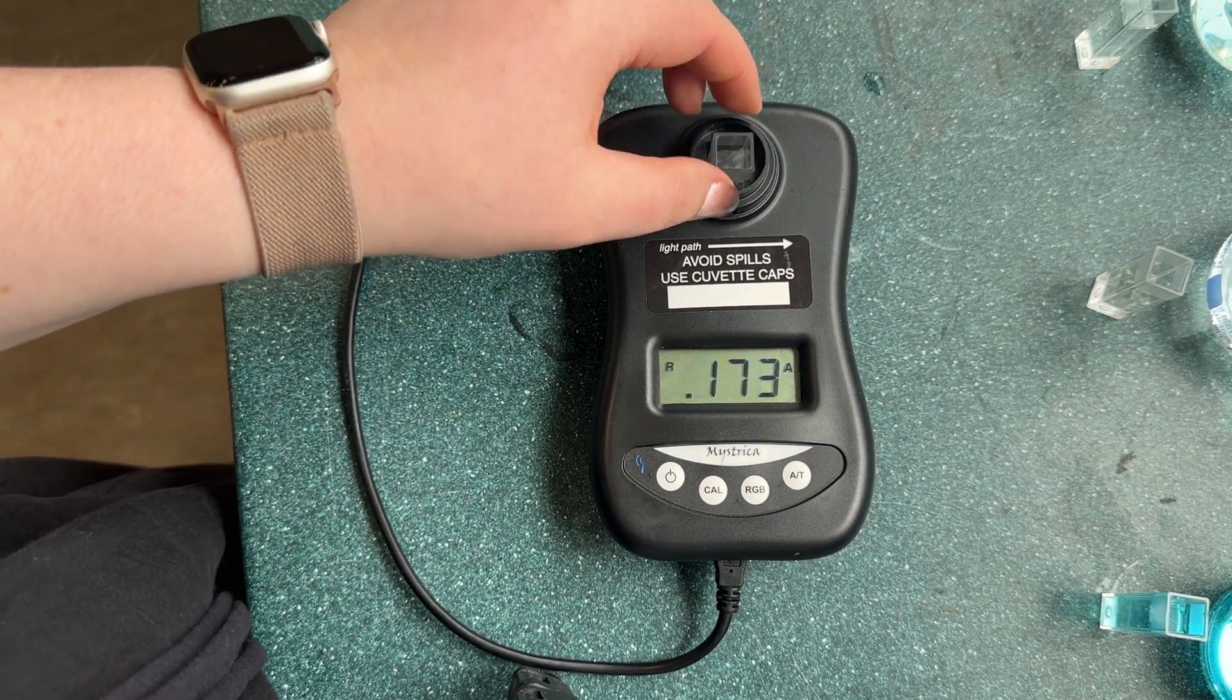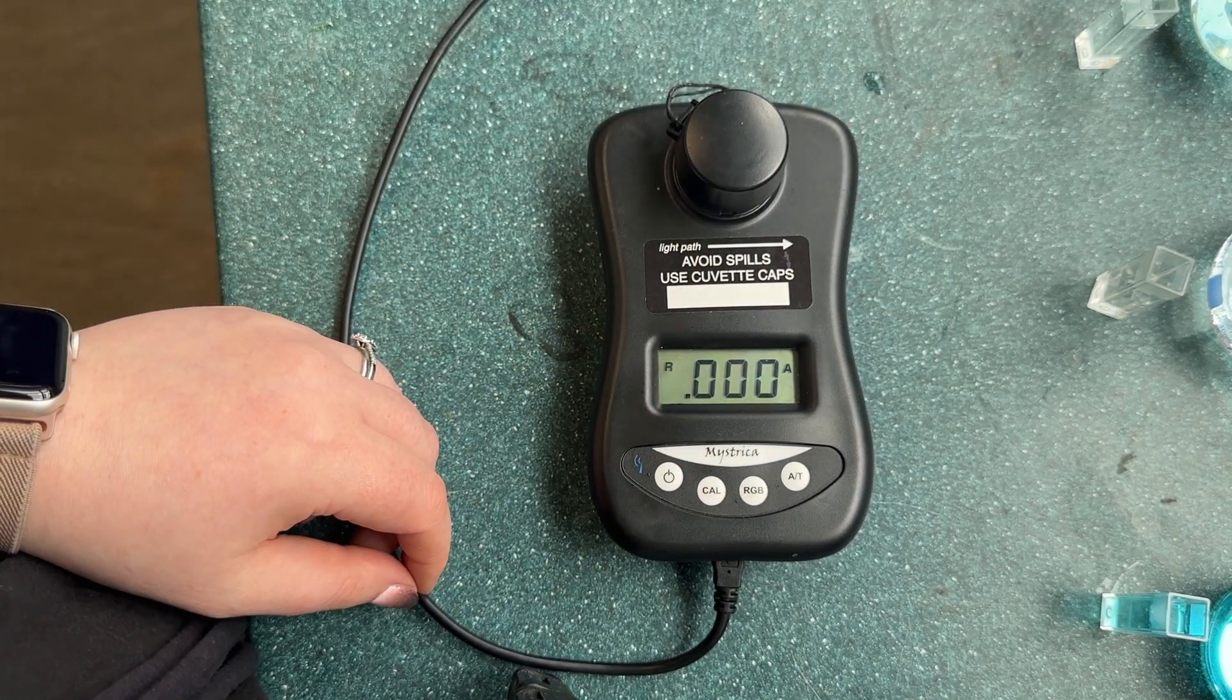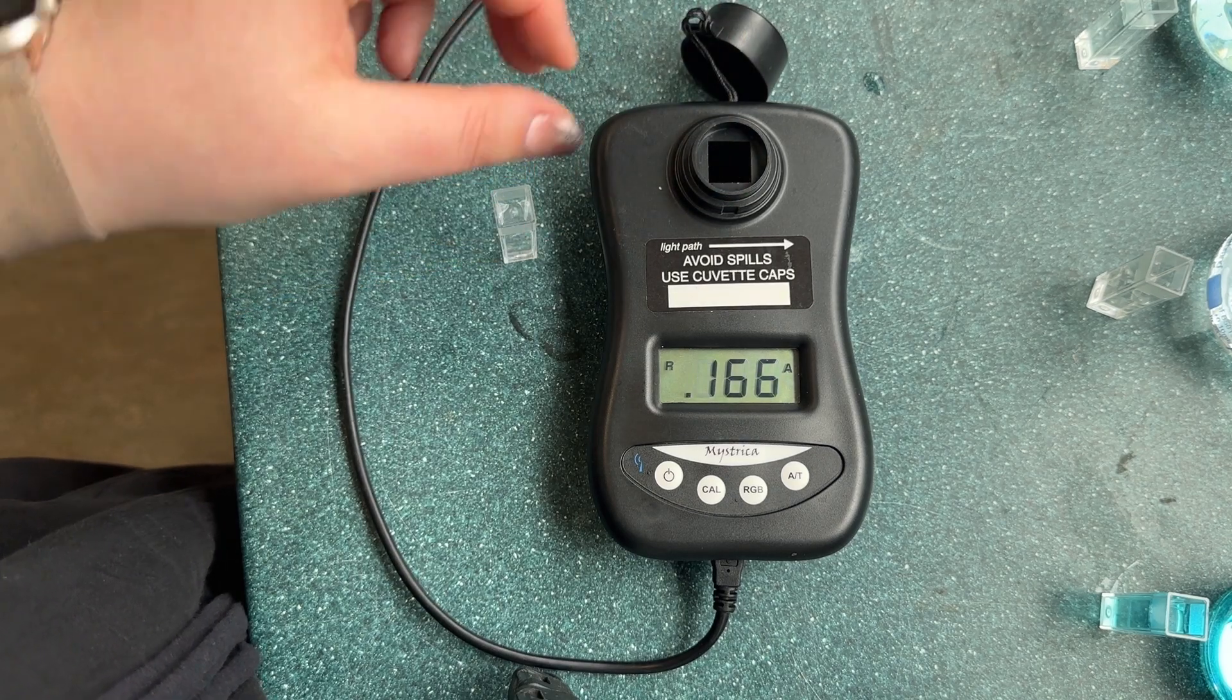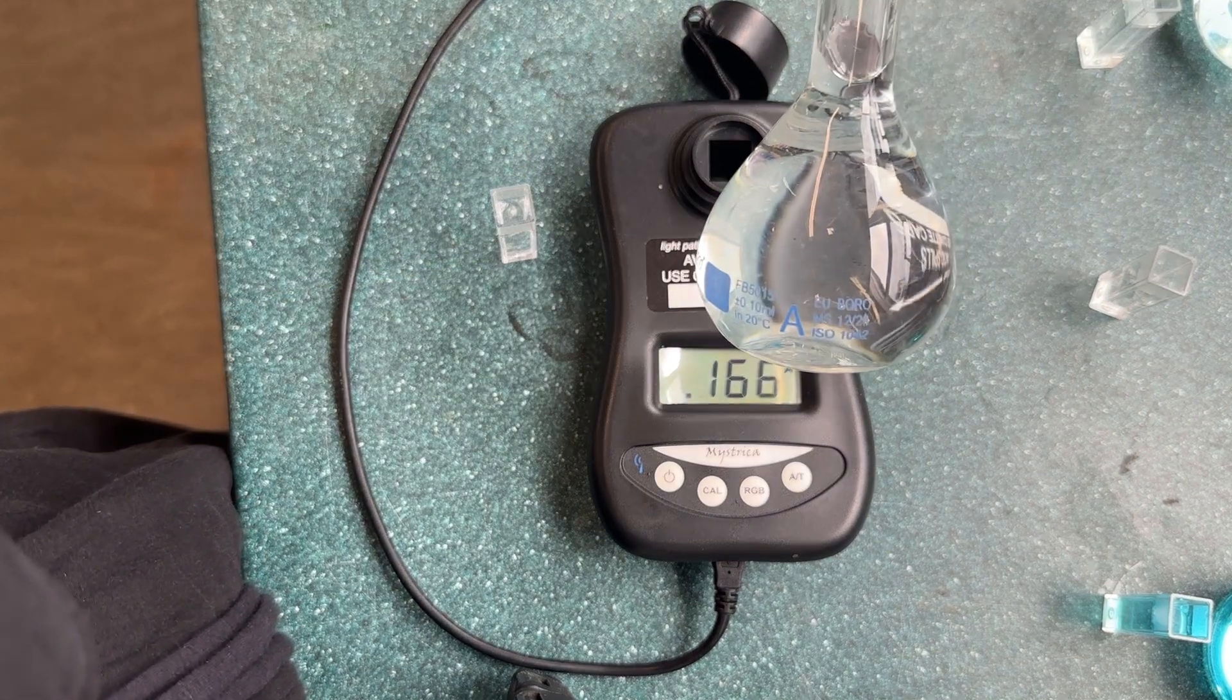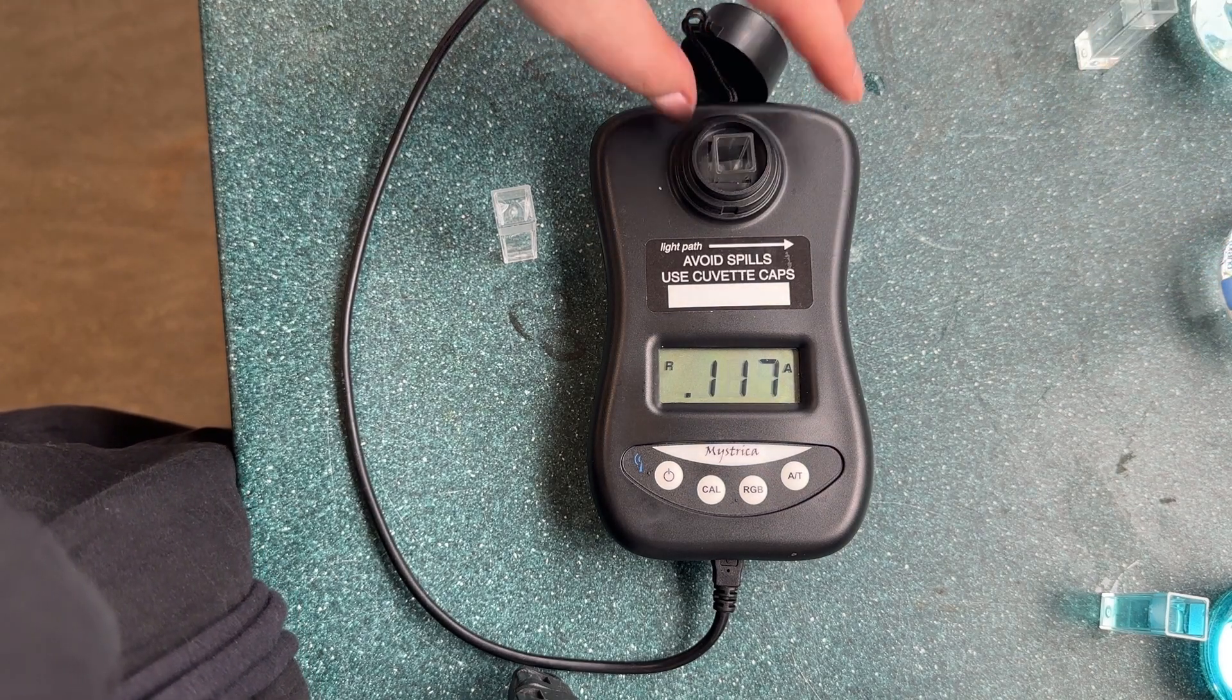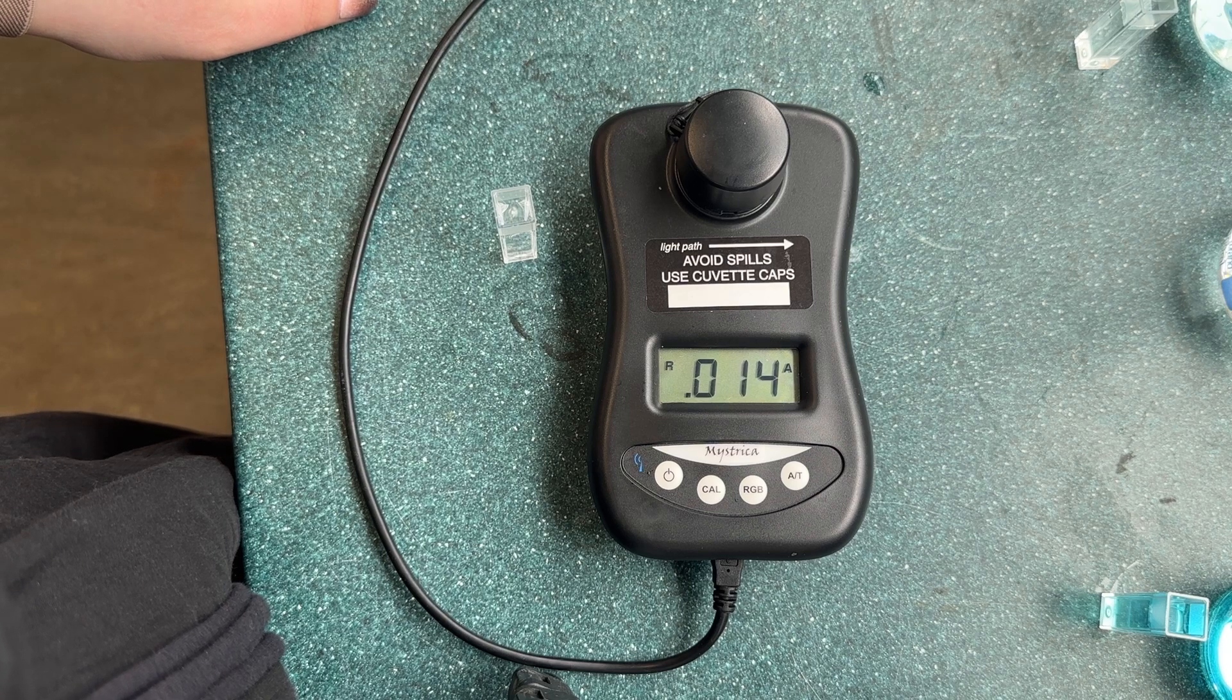We first need to calibrate the colorimeter using the solvent that was used. In this case it was water. Here we've calibrated the colorimeter and we're going to start with our least concentrated solution. This was the solution with the concentration of 0.008 moles per liter. We put the solution into the colorimeter and take the reading.